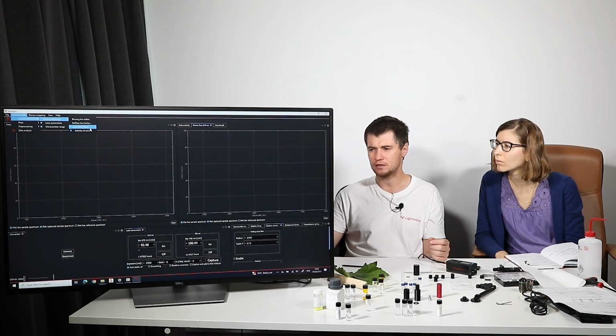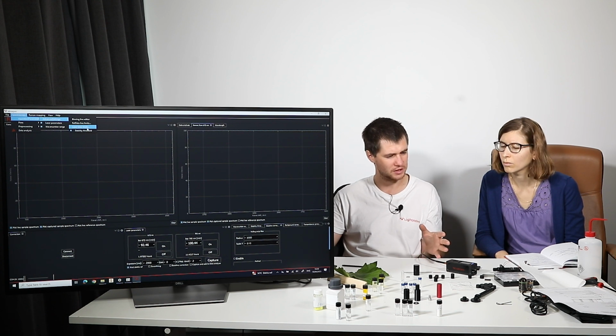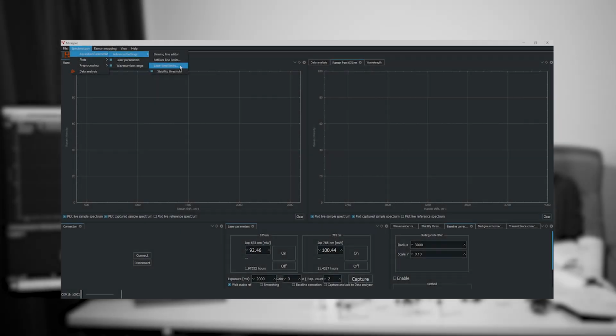In advanced settings, you would have the threshold stability. It's for the inbuilt reference channel. In order to skip the bad spectra, you can optimize this threshold. We can try it later. Then laser time limits, if you want to turn off the laser after certain operation. Let's say you operated at very hot temperature and you want to restrict using it after 10-20 minutes. But we have no limits right now.